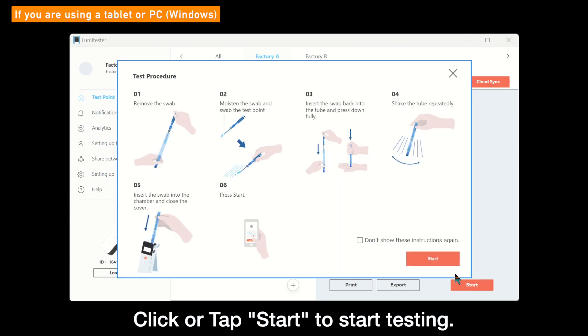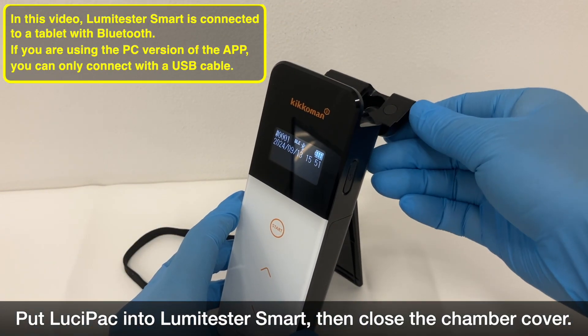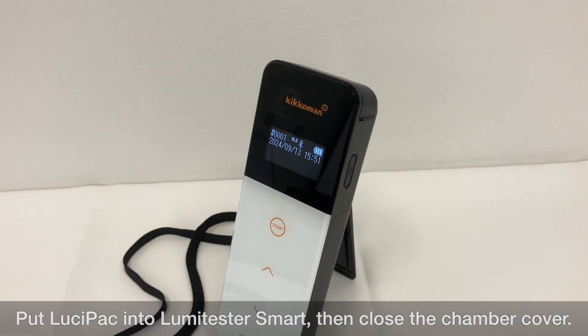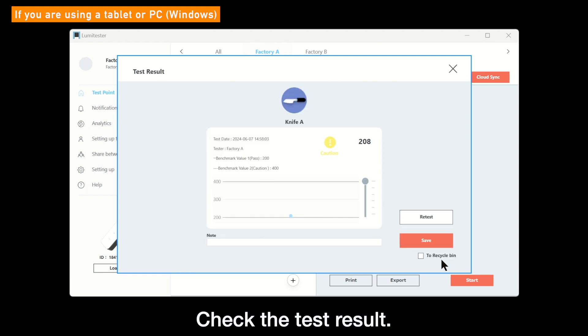Click or tap the red Start button to start testing. A simple introduction about how to make a test with Lumetester smart and Lucy Pack will be displayed on the screen. After inserting the Lucy Pack and closing the measurement chamber cover, click the Start button on the screen to start a test. As a result of the test, a judgment based on the benchmark value 1 and 2 will be displayed on the screen.